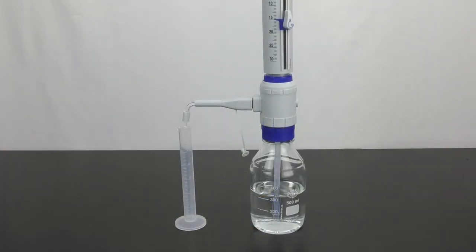One important note when you are using this for the first couple times the system is empty. You want to prime the pump by drawing up liquid and dispensing it several times until there is liquid throughout the whole system. If you just put this together your first few pumps will not be that accurate.